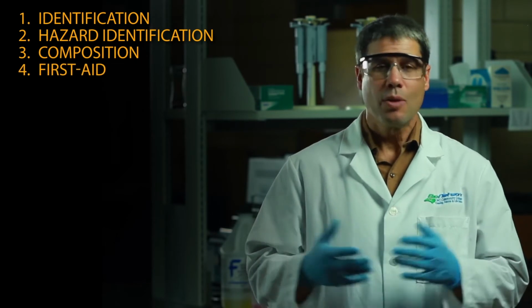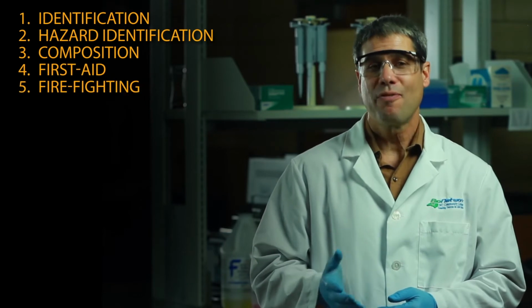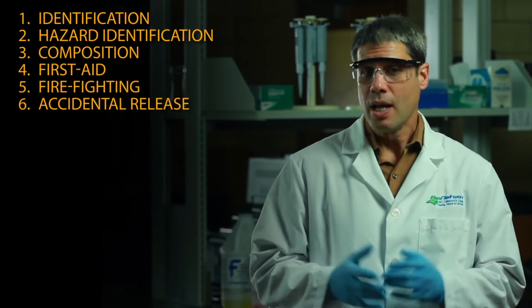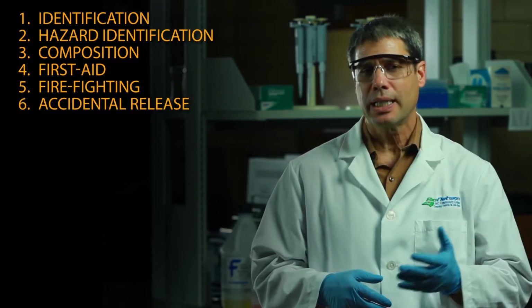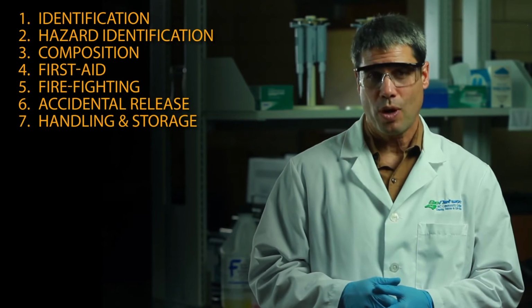Section 3, Composition, a list of ingredients. Section 4, First aid measures. What's the required treatment for a person who's been exposed? Section 5, Firefighting measures. Section 6, Accidental release measures. These are instructions for containment and cleanup of spills or leaks. Section 7, Handling and storage requirements.